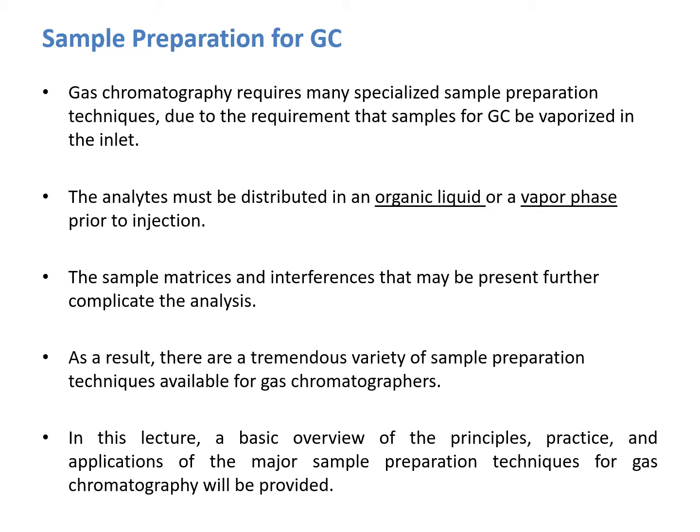The sample matrices and interference that may be present further complicate the analysis. As a result, there is a tremendous variety of sample preparation techniques available for gas chromatographers. In this lecture, a very basic overview of the principles, practice, and applications of the major sample preparation techniques for gas chromatography will be provided.